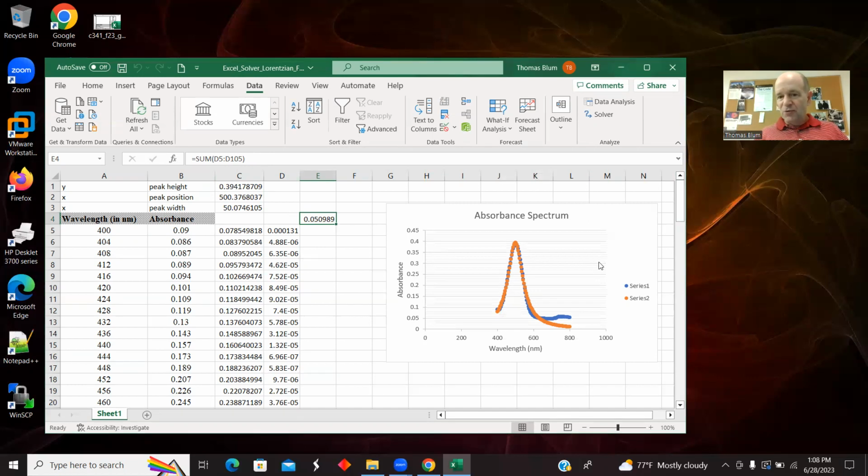It's not going to change it that much, but it has some effect. Sometimes you have more data, like we're fitting a peak, and you could argue that this data over here, after the 600, is beyond the peak. Don't use it. I did use it, but I have played this game before, and it didn't have that much effect. So I'm just going to leave it as is.